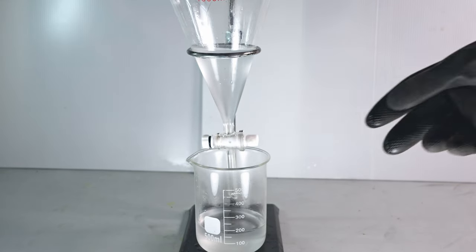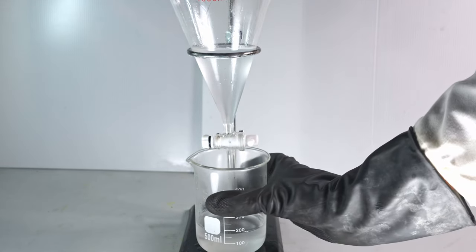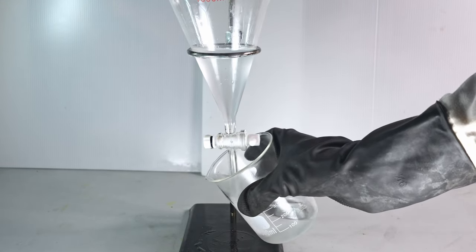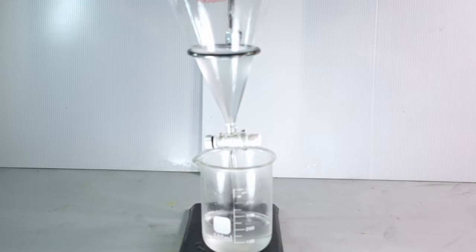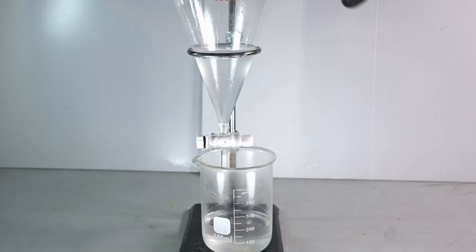Now the aqueous layer is full of a lot of acid and some unreacted alcohol, but we're just going to dispose of this, and then we're going to further neutralize any acid that's contained in our isopropyl chloride.